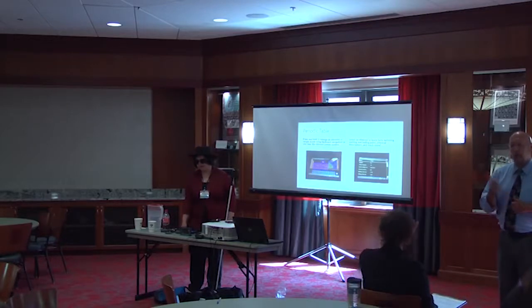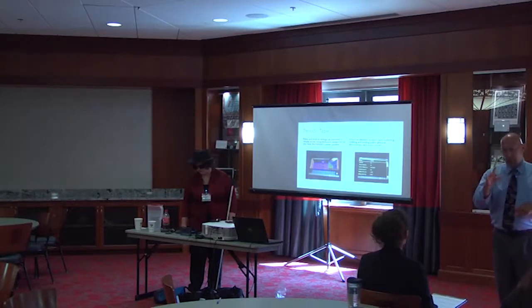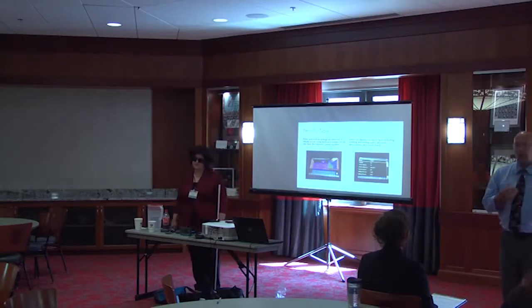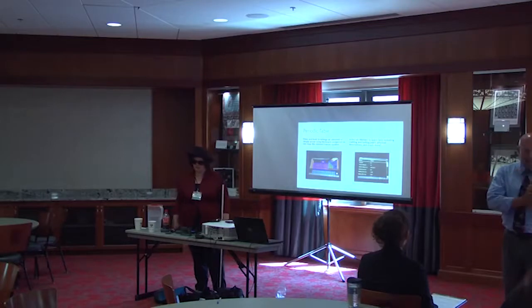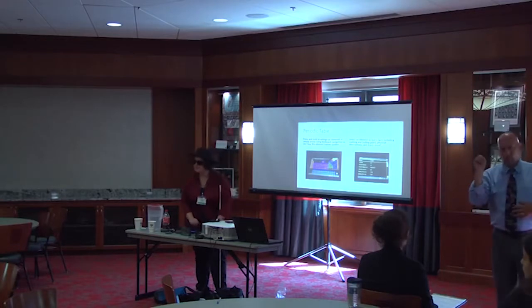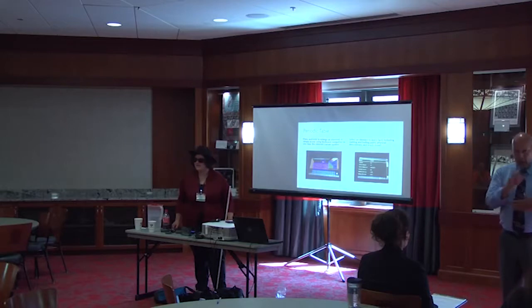So then we are going to go back up real quick. Is this the page that says features on it? Am I in the way? Additional features and key commands. All right, so that will have a lot of your key commands on there, so you don't have to memorize them from my presentation. And I don't think anyone did.